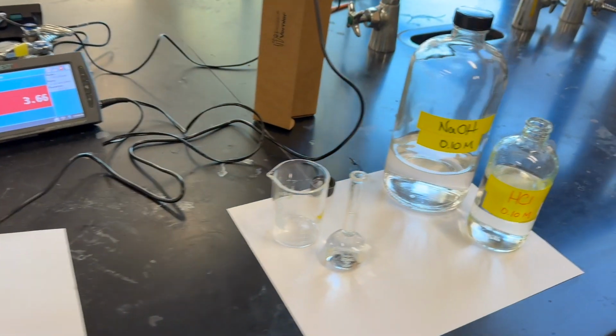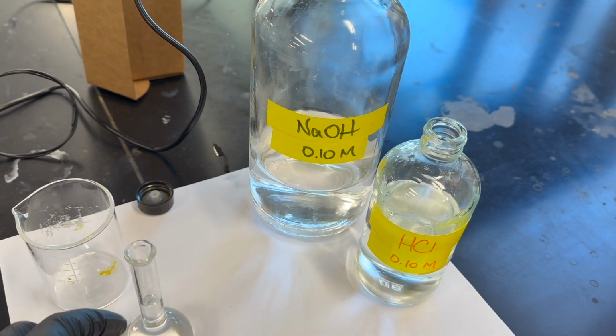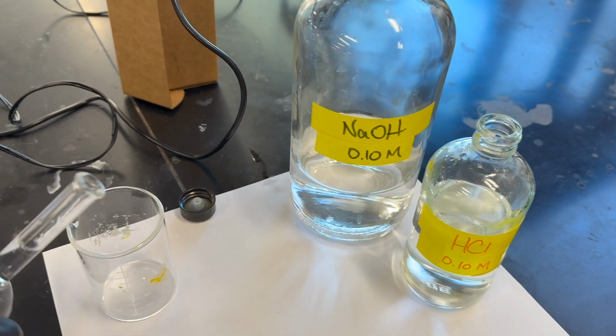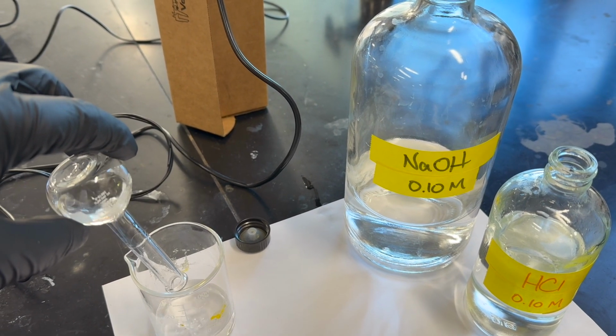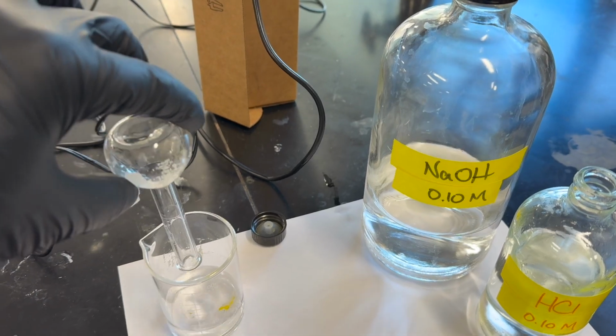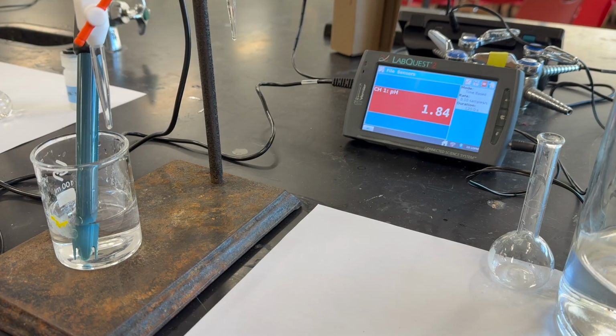And we have carefully measured 25 milliliters of hydrochloric acid. So the first 18 milliliters have been added in 2 milliliter increments. So now we begin from 18 to 22. We're going to add 1 milliliter at a time and record the pH.